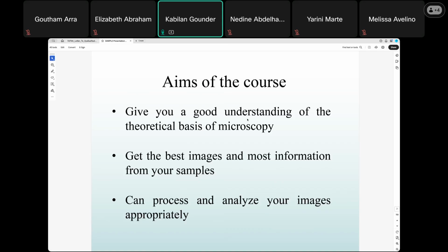In the lab, seniors or your mentors or research professors will teach you: this is a slide, you see the images under the microscope, take a picture and interpret. But if you want to improve the quality of your images, your samples, and the interpretation, all three are very important to validate your data.